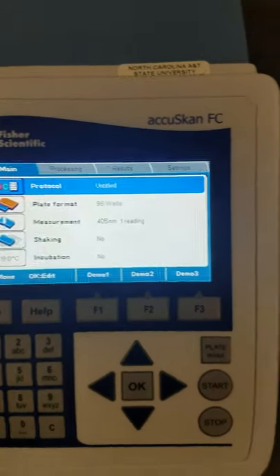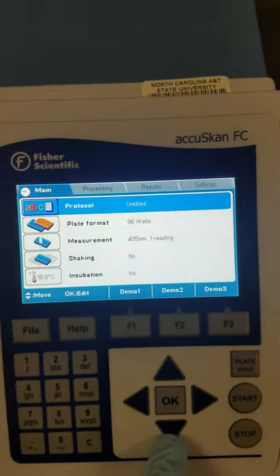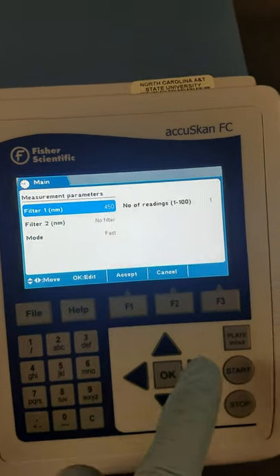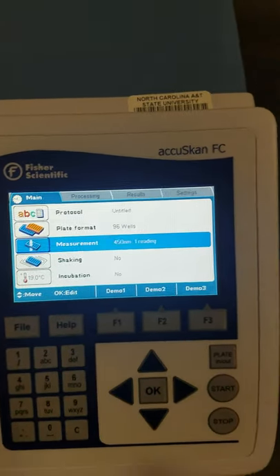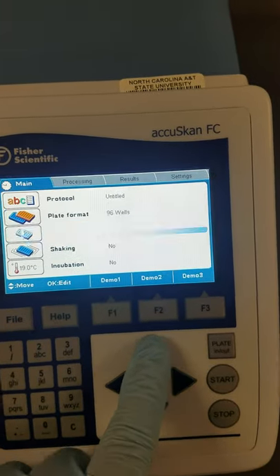We're not going to be doing anything complex, so we don't really need a whole lot. But we do want to go down and change our measurement to 450 nanometers for our wavelength. And that's it as far as this main screen.